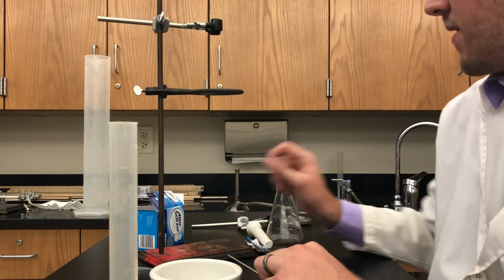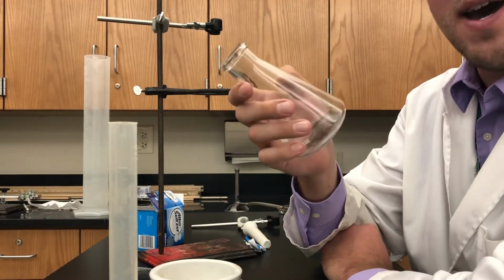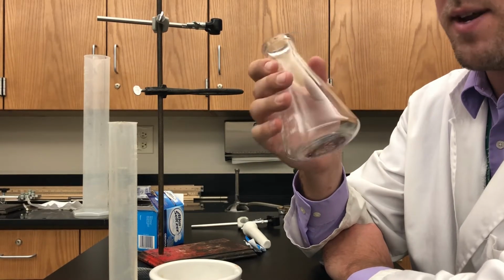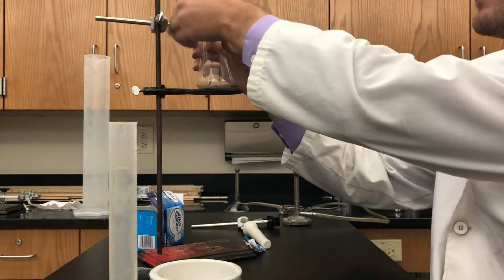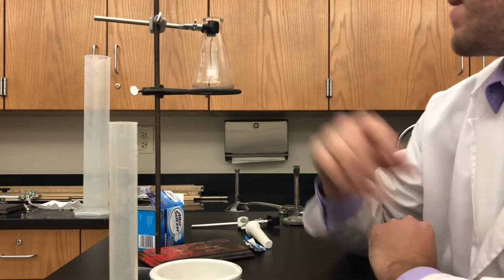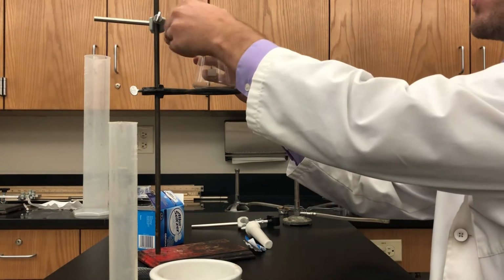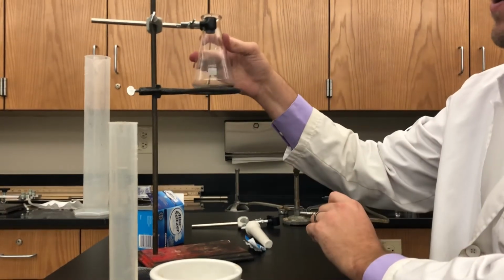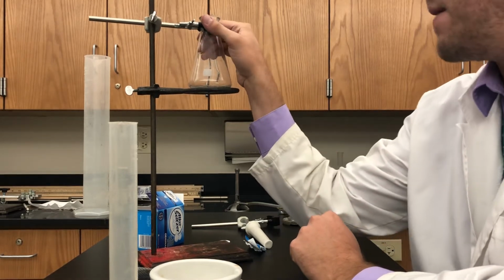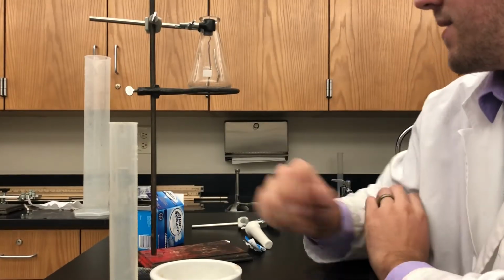So, another safety concern. We are dealing with glass. You do not want to break an Erlenmeyer flask, and if you do, you need to let me know right away so we can get that glass taken care of and it's not going to hurt or cut anybody. The most likely way that it would get broken, besides just somebody being careless and dropping it, is the collar on here on the test tube clamp. You want to tighten it enough where it's snug. So right about here, you can notice that it's not moving around, but it's not super tight on there. I've had people snap a neck on there before because they tighten it so much that it just squishes that glass in there.